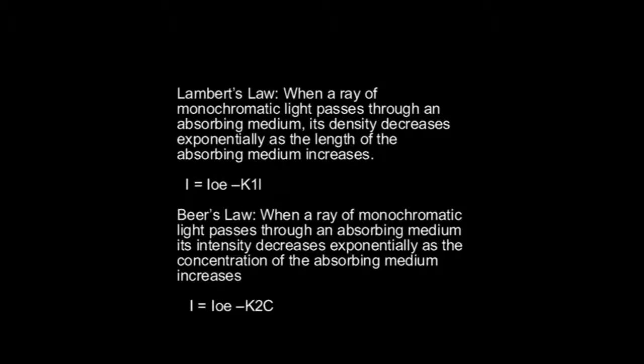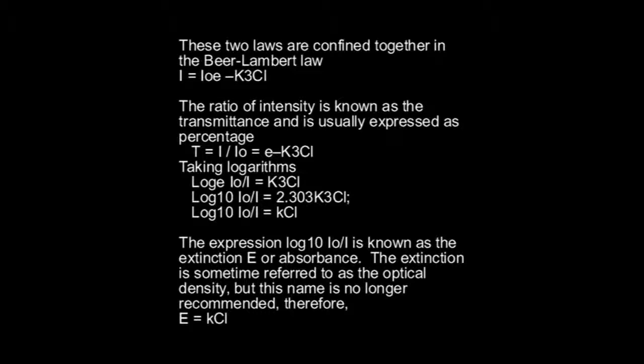Beer's law: when a ray of monochromatic light passes through an absorbing medium, its intensity decreases exponentially as the concentration of the absorbing medium increases. These two laws are combined together in the Beer-Lambert law.